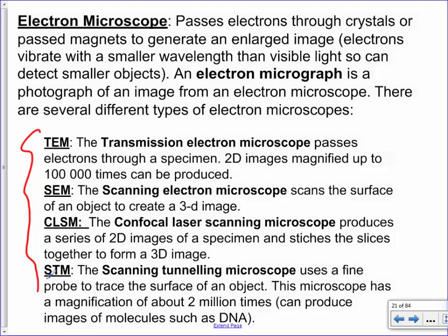Electron microscopes, there are a couple of different varieties. Again, I don't have experience with these, so all I can tell you is what I've learned myself. But there are a couple of different varieties. So I'll just read off what I've got here.